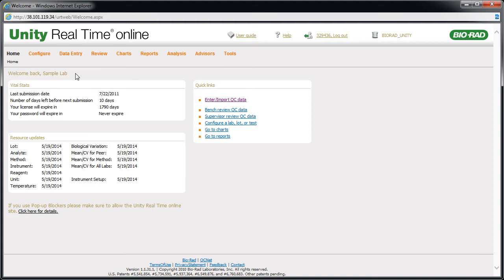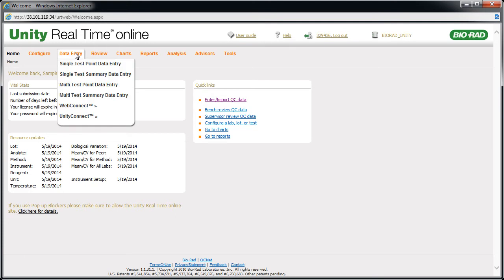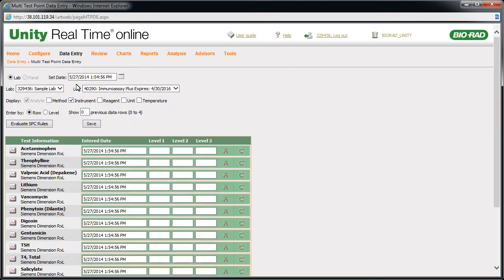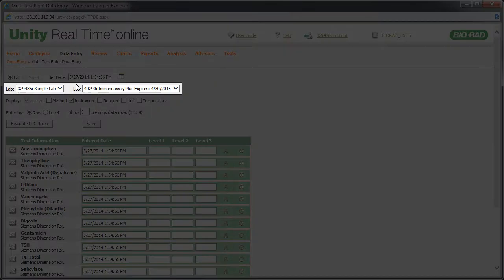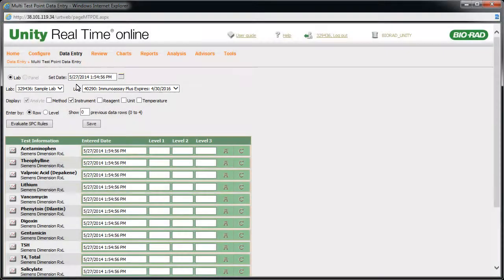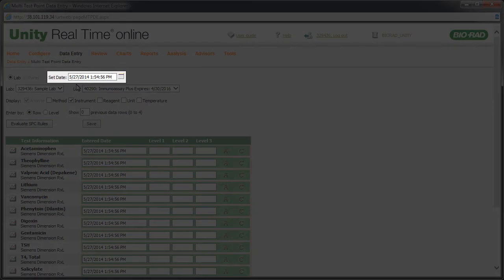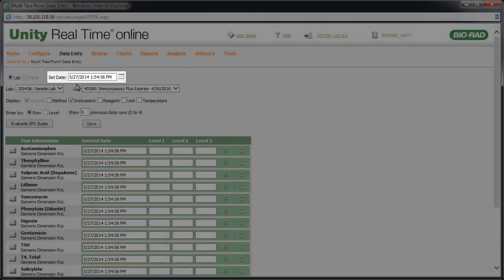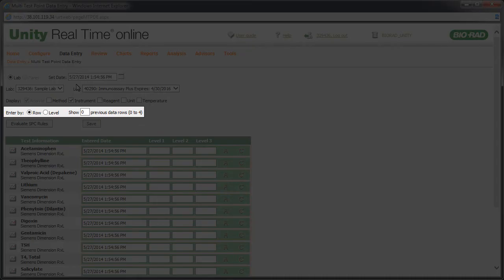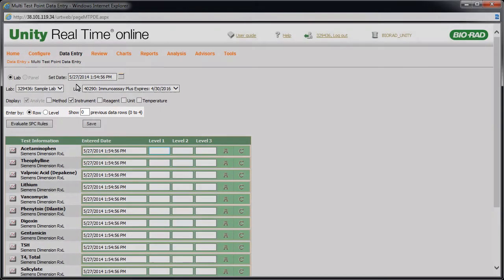Point to data entry and click Multi Test Point Data Entry. Select a lab and lot. Set Date allows you to set the date for all tests. You can enter data by row or level, and determine how many rows you want to see prior to the current row.